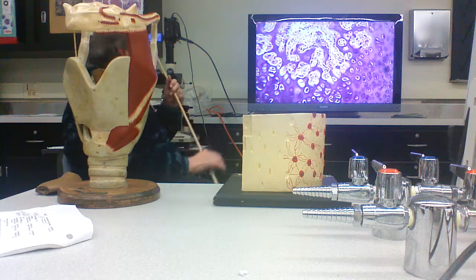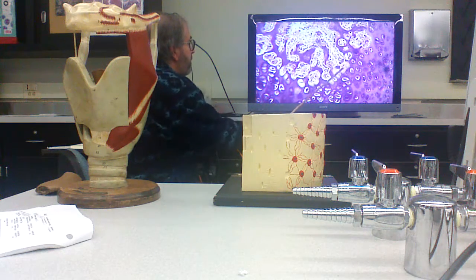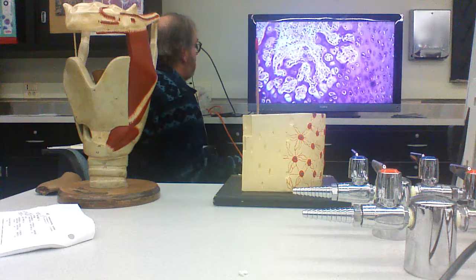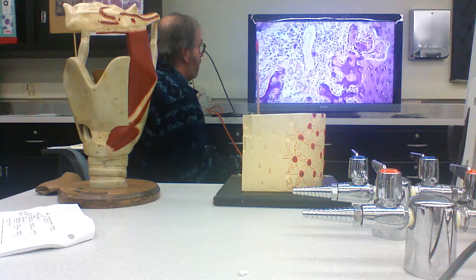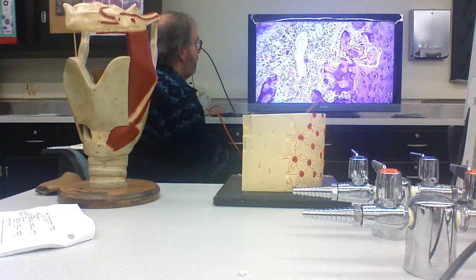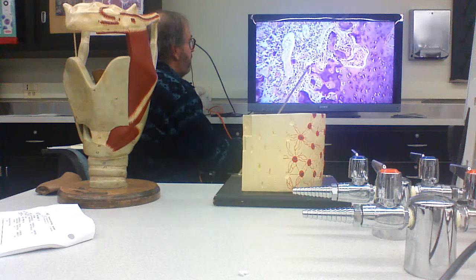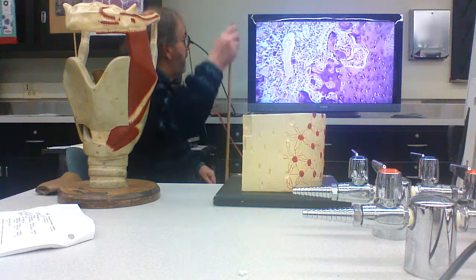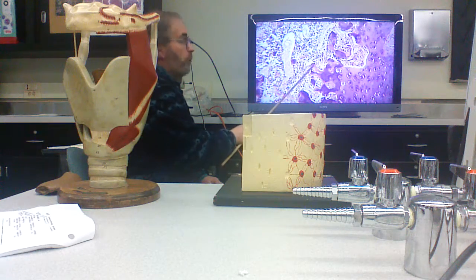They're giant cells, and they tend to form on little caverns on the bone where they're digesting away. And here's one, multiply nucleated, 2, 3, 4, 5, 6 in this section, and they form this area here, which is called Howship's lacunae, and they're basically eroding the bone there.